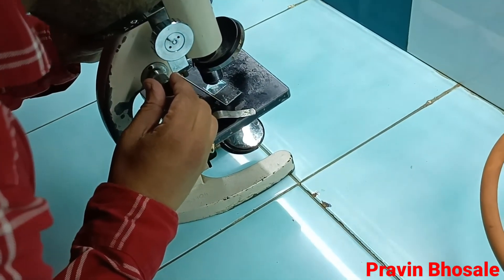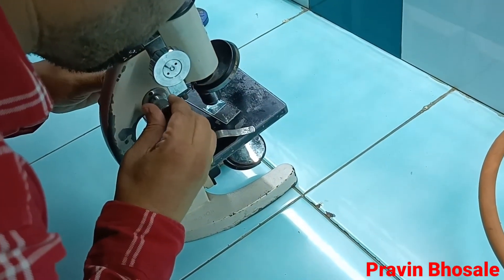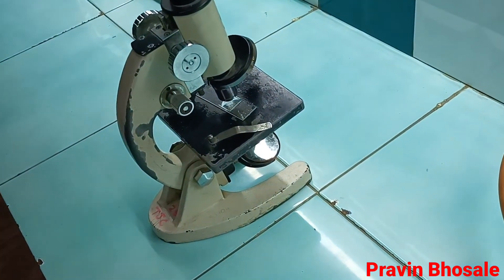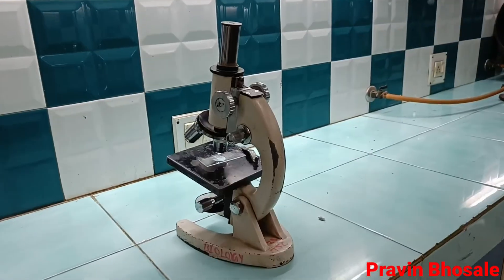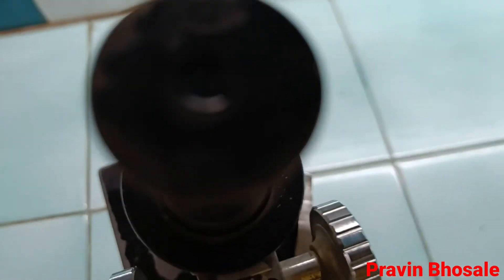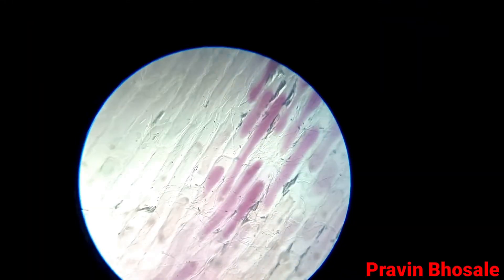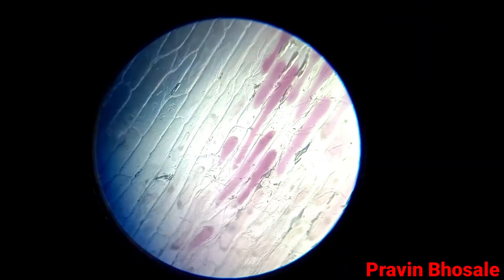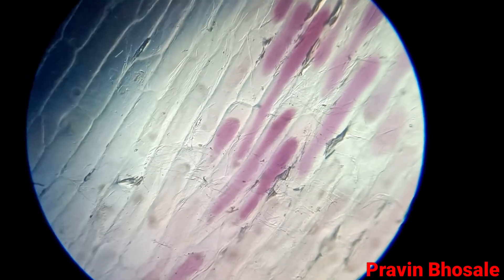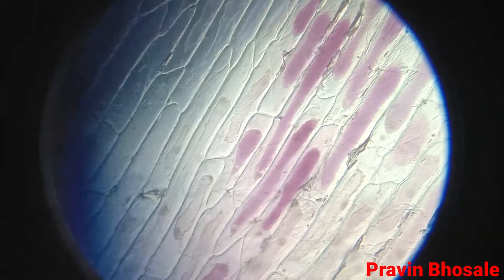Now move the body tube in the upward direction and adjust the slide. The slide is adjusted. Now let's see through the eyepiece. You will see plasmolyzed cells — the colored part is the protoplast. You can see plasmolysis.